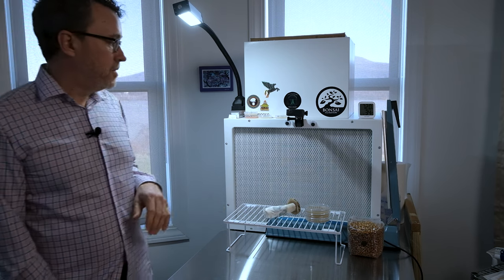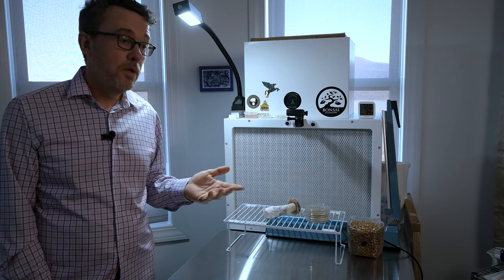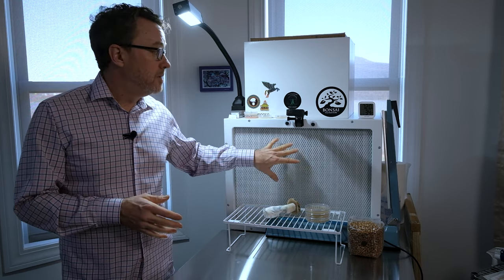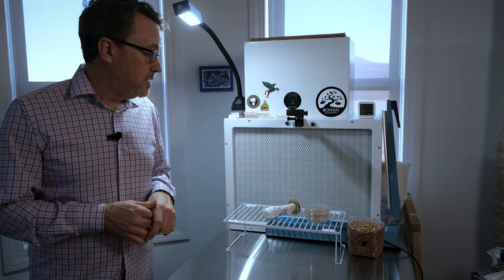I've been growing mushrooms on and off for 25 years and have only recently acquired a flow hood. At a bare minimum, to do agar work you're going to need a still air box — there are great videos on YouTube if you search it. You can be very successful working in a still air box; I was for years. I finally made the jump to more professional equipment. This flow hood is a game changer — I'll do a video one day on my Bonsai flow hood and modifications I've made to it.